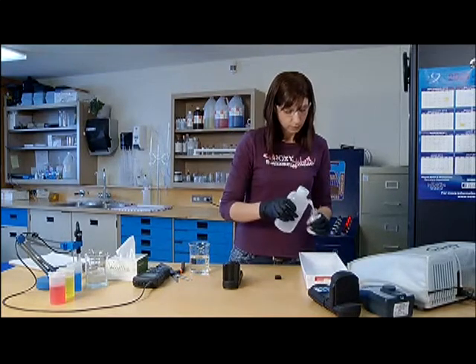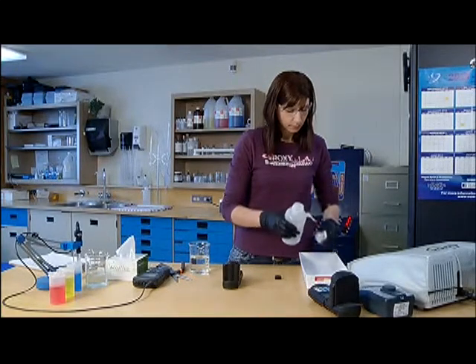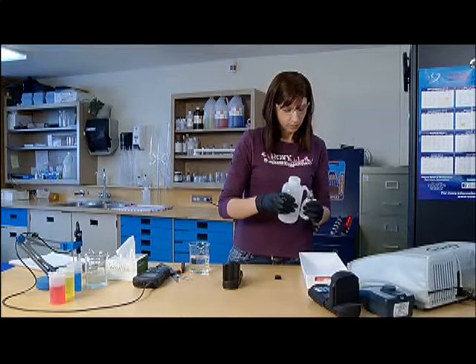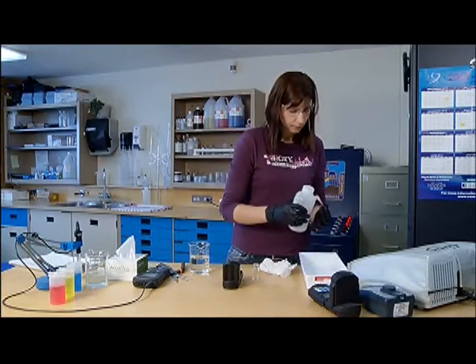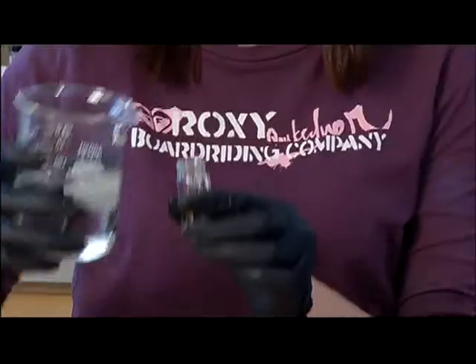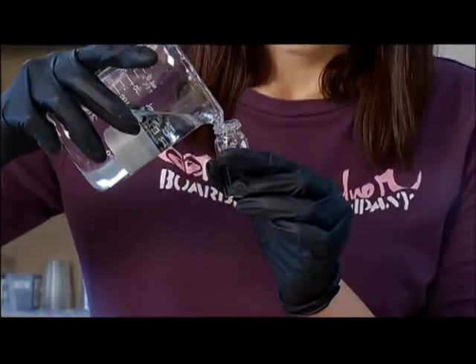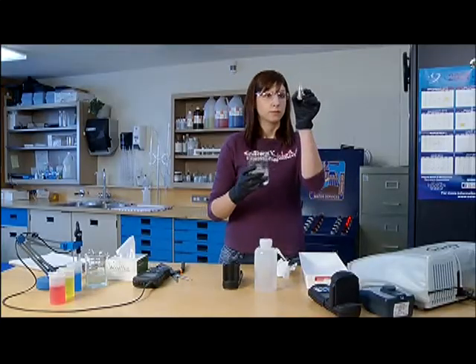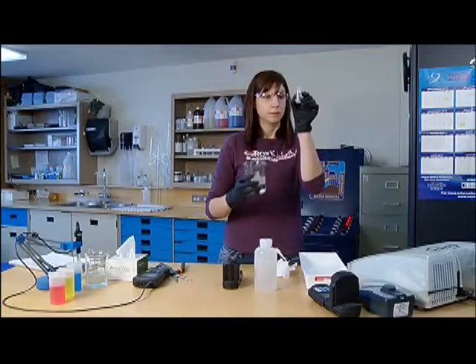Ensure the colorimeter sample vial is clean and free of contamination from previous samples by rinsing 3 times with lab-use approved ultra-high-pure water. Ensure the vial cap is also rinsed. Fill the sample to the designated sample line on the vial.